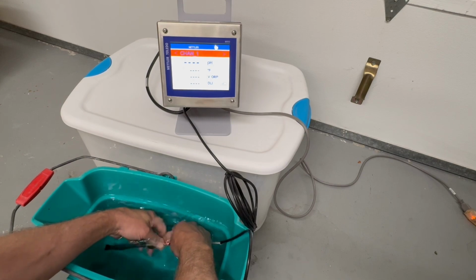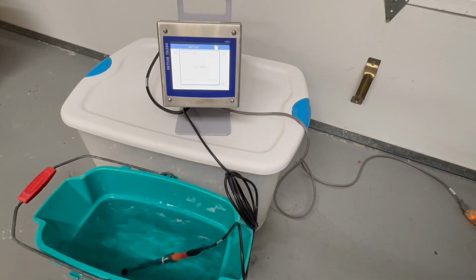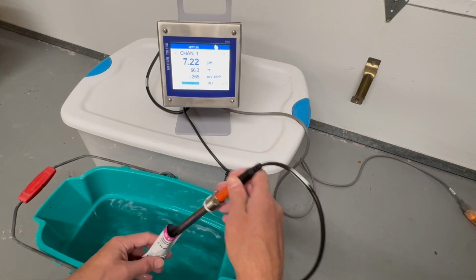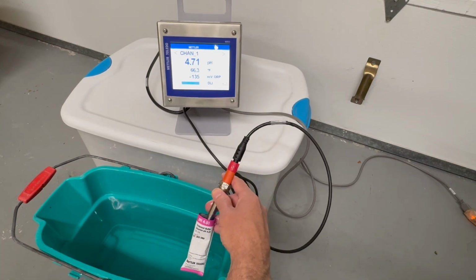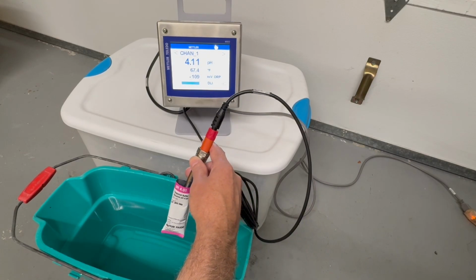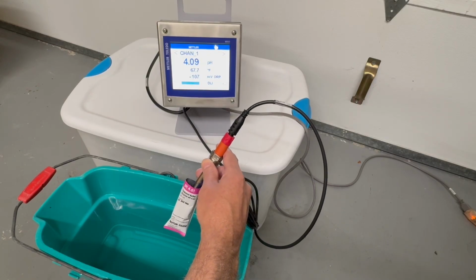Now with the sensor and connectors still submerged, we're reconnecting it. We'll let that handshake occur. It very quickly recognizes there's a sensor, and it goes back into normal operation, as we see here. Then we'll speed up the time frame to let the sensor equilibrate back to the pH value at which it started, which was in the low 7s. Now, out of interest to see how it performs, since it was in pH 4 buffer, let's put it back into that and let it equilibrate. So essentially, this is all about the integrity of the sensor connection.